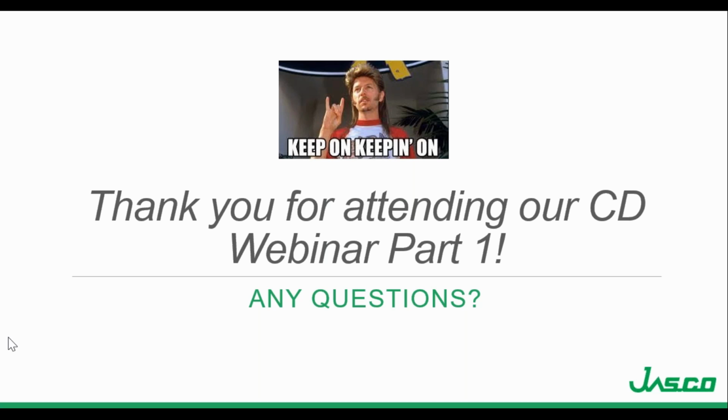So you definitely should be able to do RNA structure with CD. If you have some questions about, is it feasible to measure RNA structure, or is it too unstable to generate a measurable signal? You can definitely do RNA with CD. If you have questions about your particular system, shoot me an email. We will be sending out emails to everyone that attended this seminar with my email, so that if you have additional questions that are very specific, I can answer them.